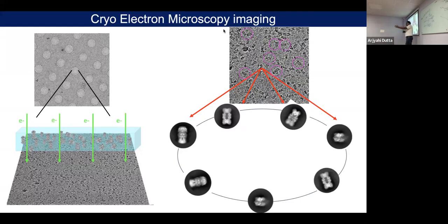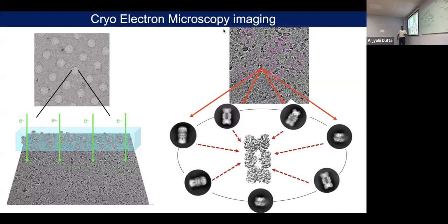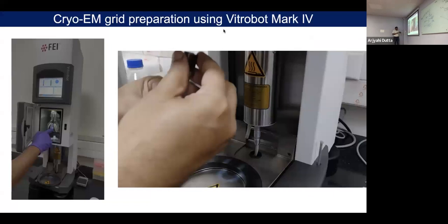Same as with hands: if I take your left hand and my left hand, someone's will be smaller, someone's will be bigger. If they are the same category, we put them together and classify that, okay, this is one category, this is the second category. For this classification, generally we are using the K-means clustering, okay, to classify those particles, and then we get the 3D structure from that. So we'll not talk about this one today.